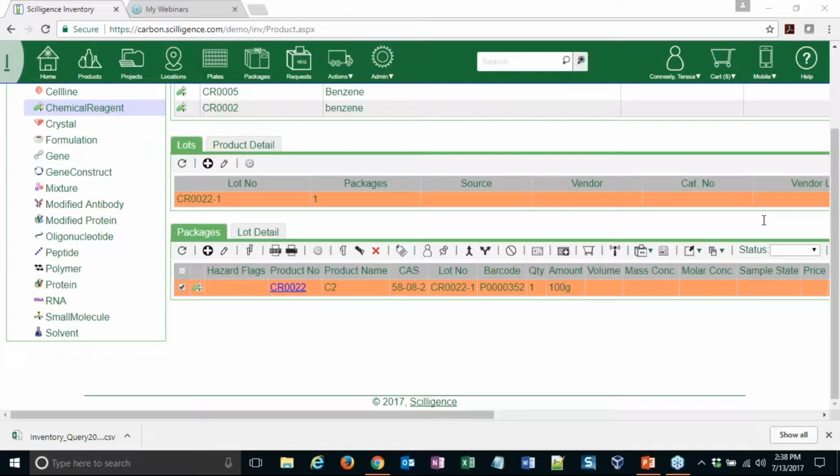I'm using an ELN and registration system from another supplier. Can your PMF and inventory be integrated with them? Yes, using the APIs that were just mentioned, we just have to see what your system is and work with the other systems and their requirements to integrate with our system.